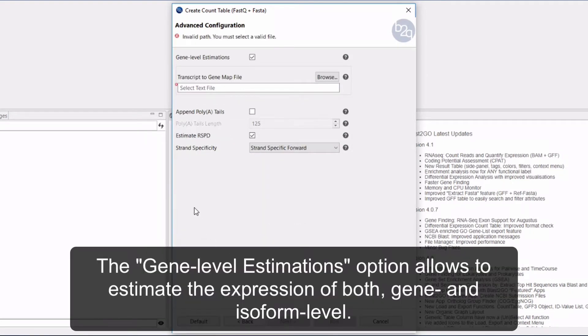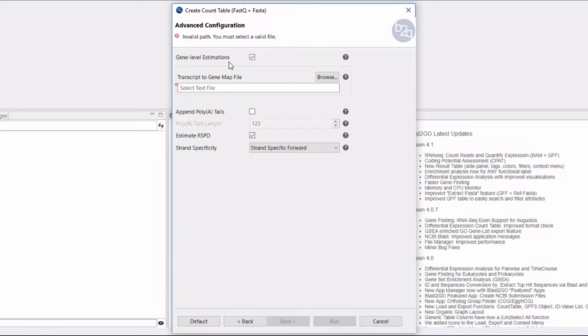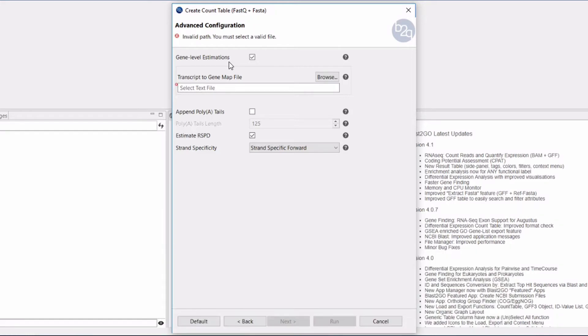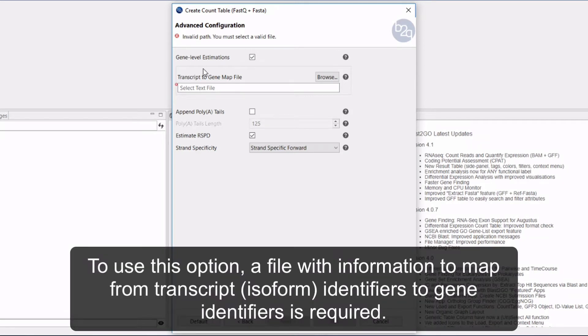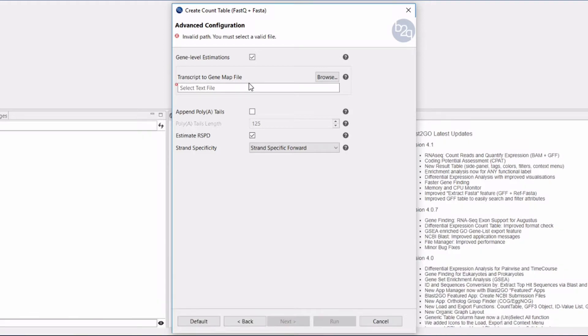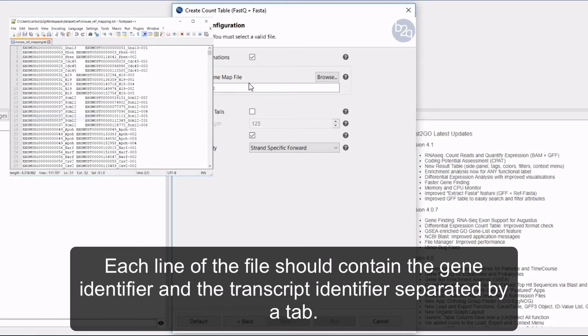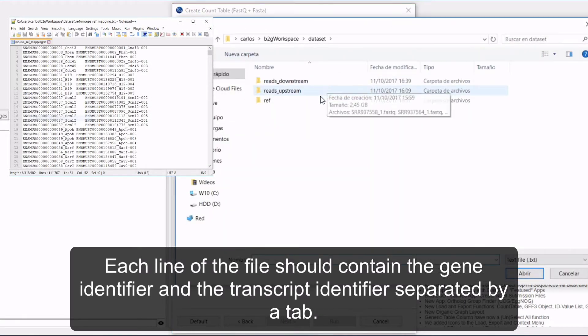Gene level estimations option allows you to estimate the expression at both gene and isoform levels. Gene expression estimates are the sum of all corresponding transcript expression estimates; results are provided separately. To use this option, a file with information to map from the transcript isoform identifiers to gene identifiers is required. Each line of the file should contain the gene identifier and the transcript identifier separated by a tab.